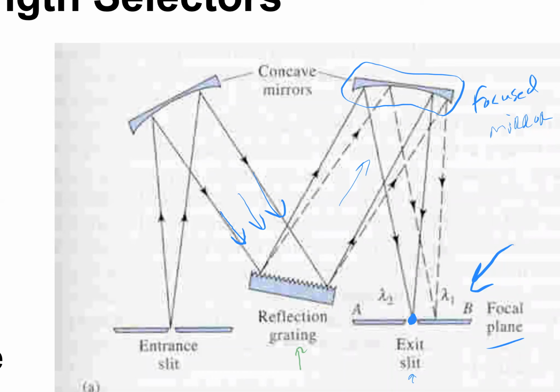Maybe over here is some, oops, let me switch back to my pen. Over here, there's some green light. They recombine there. And then maybe here there's yellow, and then here there's red. And then maybe on into the IR and the UV down here, right? There's light we can't see.